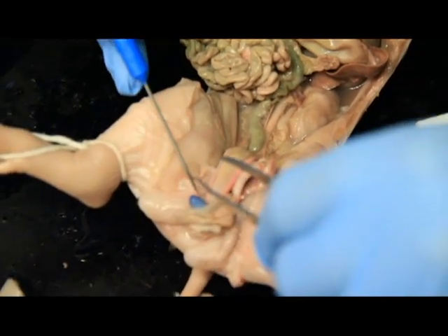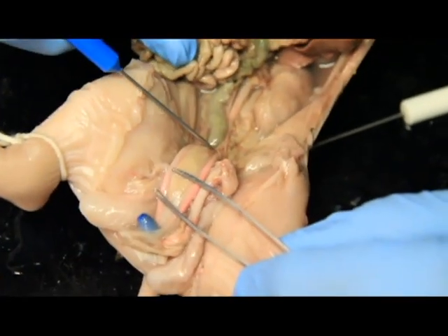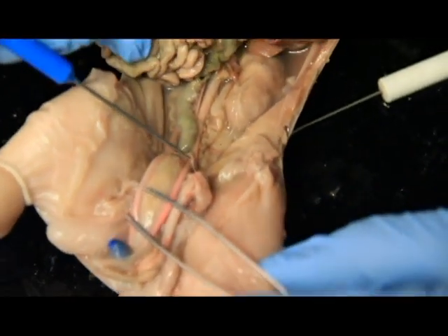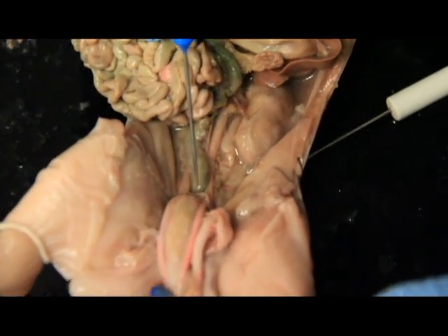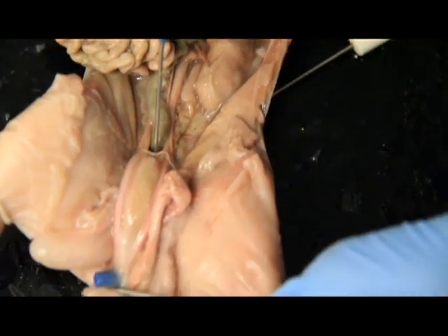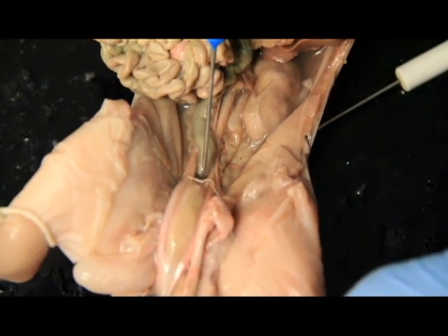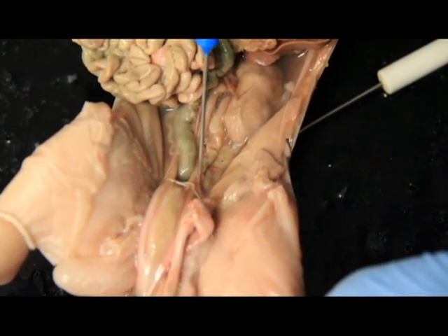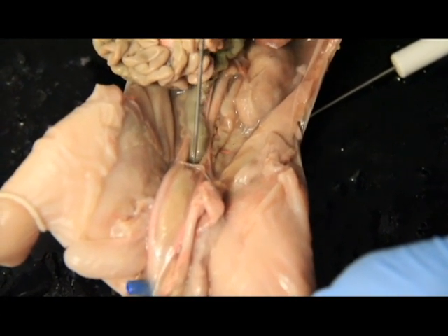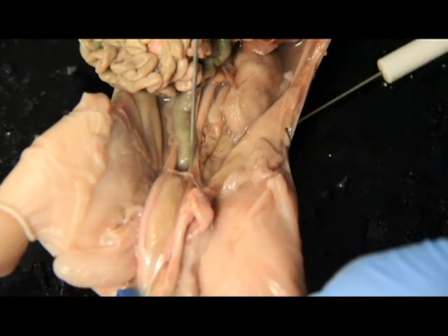Okay, and then if we were to flap this urinary bladder down, what we see here is these very small tubes. And you have to think of it as kind of like a Y. And so the base of the Y is down in here, in this little hole area right here. And that's going to be your seminal vesicles. And that seminal vesicles is the base of the Y. These right here are the arms which come up from here and then out this way, and this way. These are the arms of the Y. These are your vas deferens.